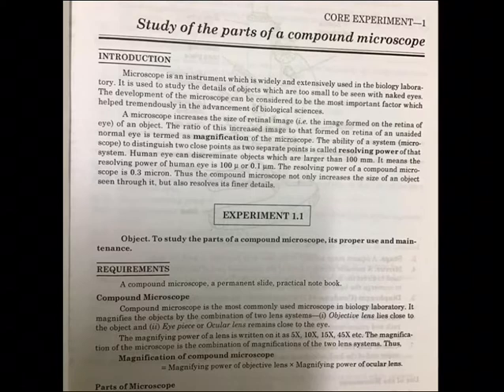So what is the object? To study the parts of the compound microscope, its proper use and maintenance. Requirements: the requirements are a compound microscope. We have very good compound microscopes, permanent slides, and then a practical notebook. The compound microscope is the most commonly used microscope in a biology laboratory.